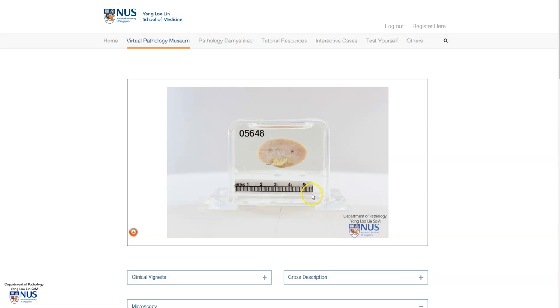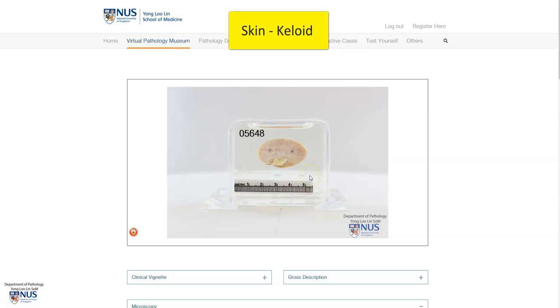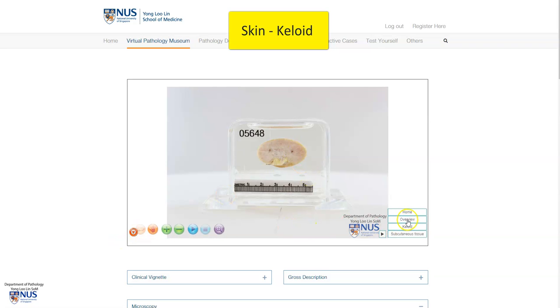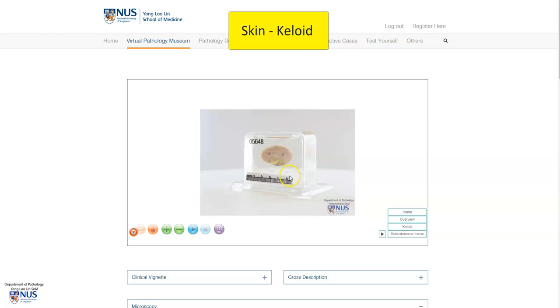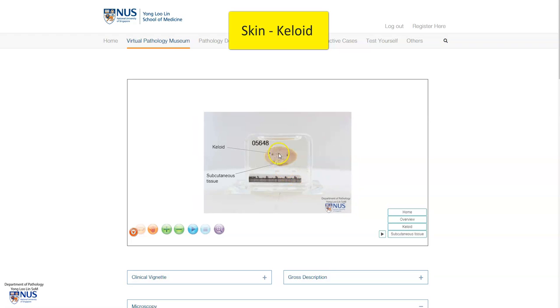This is a virtual pathology specimen of a keloid in the skin. Just to orientate ourselves, we are looking at the cut surface. This shows the cut surface of the keloid itself, and we will look at it in more detail very soon.